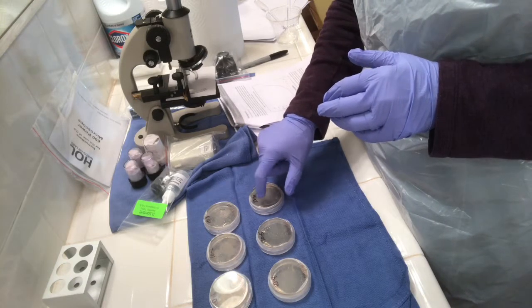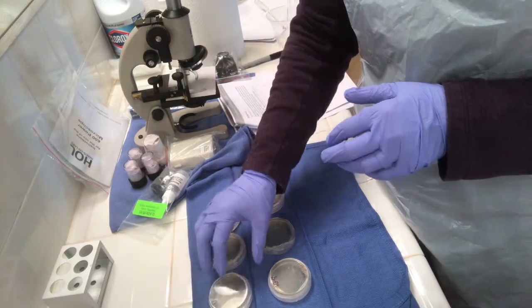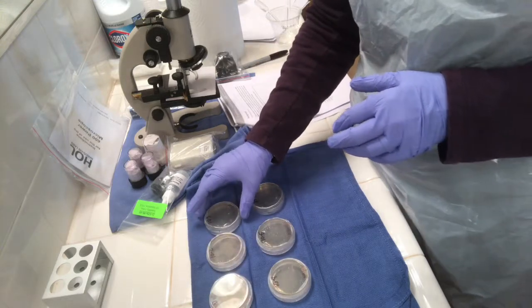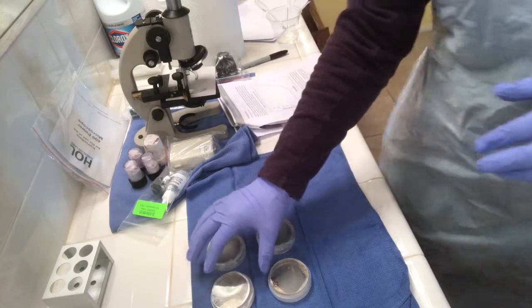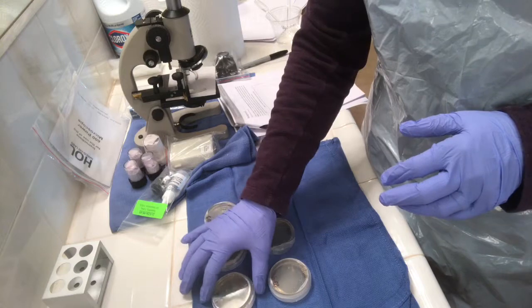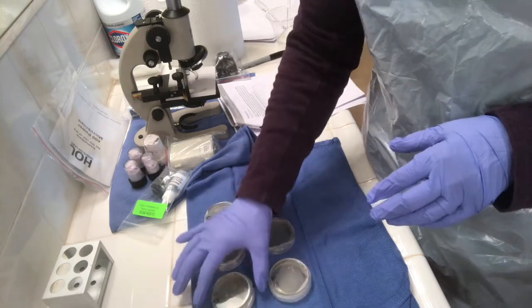The viable numbers are from 30 to 300. Below 30 is considered not viable, and above 300 is not viable. Below 30 because it's just not enough of a solution, and maybe they didn't grow. And above 300 there are too many, and they kind of overlap each other, so it's too hard to count.